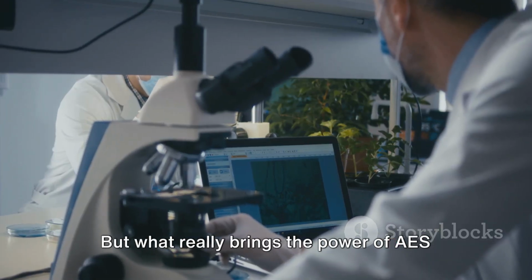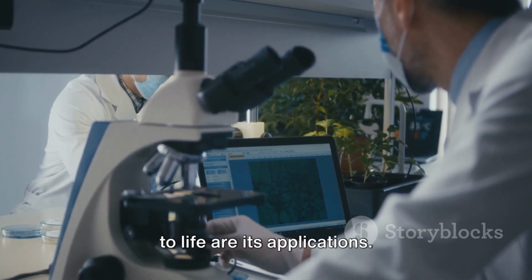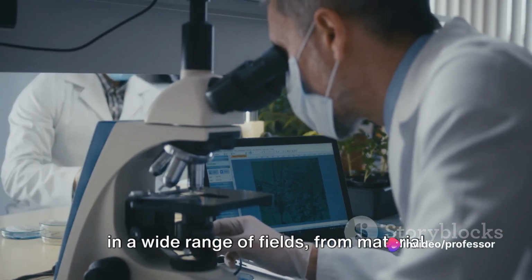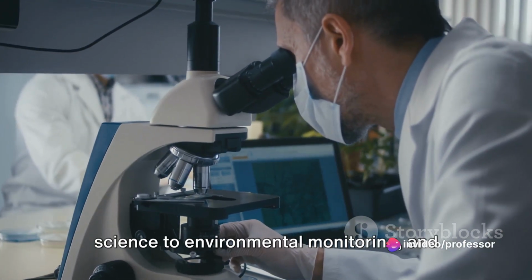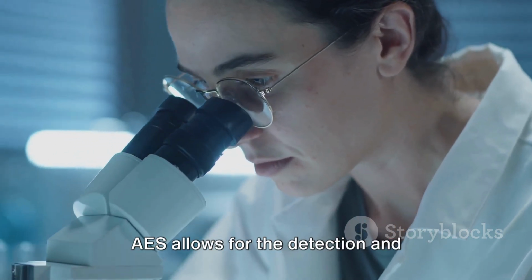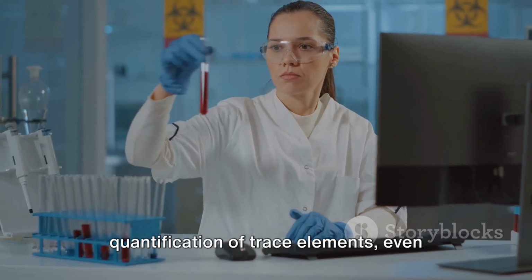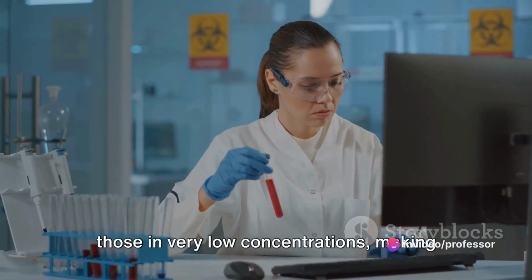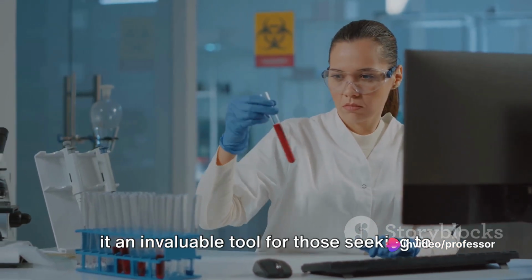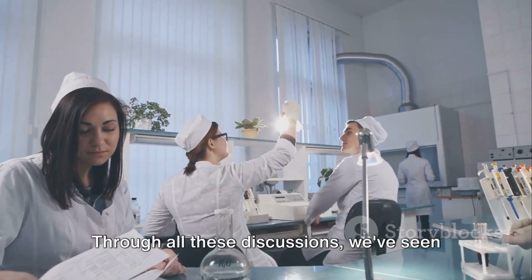But what really brings the power of AES to life are its applications. We discussed how this technique is used in a wide range of fields, from material science to environmental monitoring, and from forensic science to the food and beverage industry. AES allows for the detection and quantification of trace elements, even those in very low concentrations, making it an invaluable tool for those seeking to understand the composition of materials or the nature of environmental contaminants.